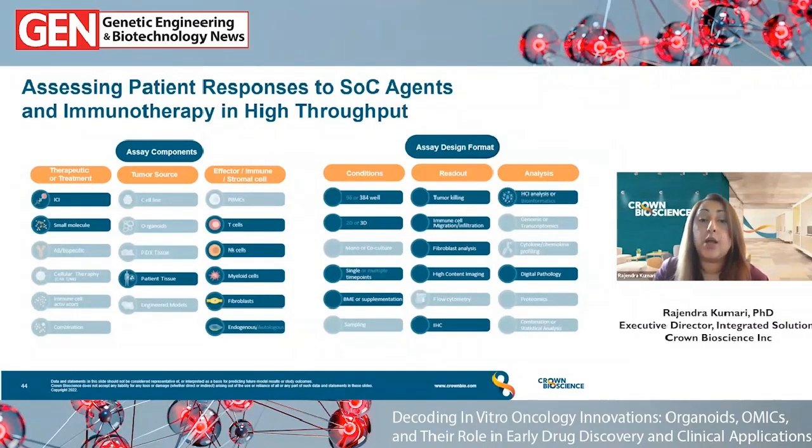As this is a complex assay, the tissue structure and the readouts need to be measured. So it needs to incorporate high content imaging, as well as some of the downstream analysis. You can actually incorporate other readouts such as cytokine analysis, flow cytometry, or next generation sequencing for these types of assays, just to get more information, because these are obviously very valuable tissues.